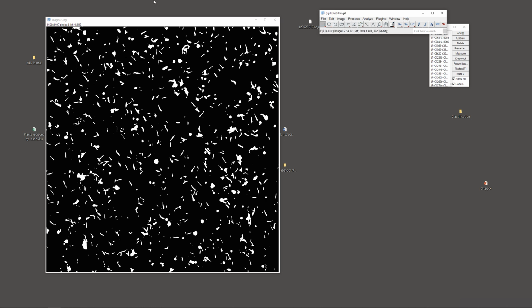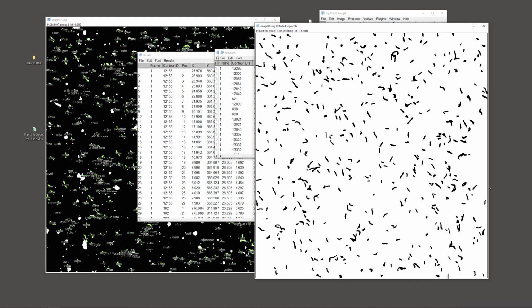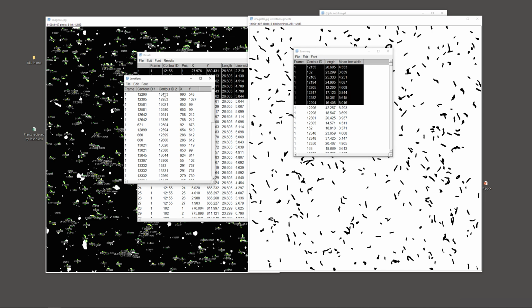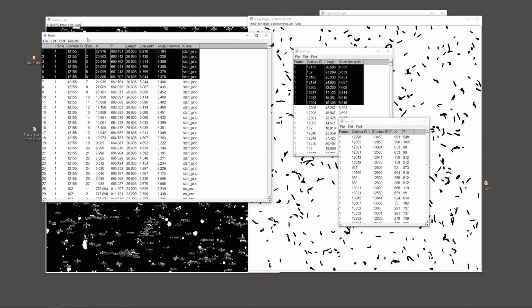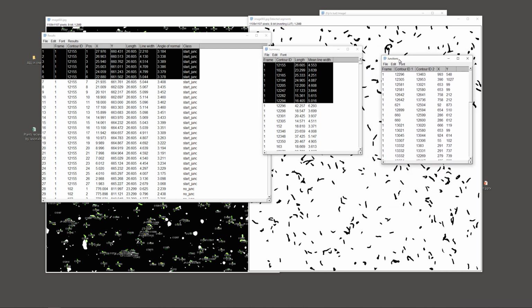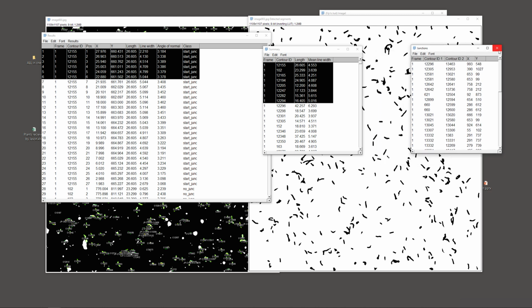So you will have this. You will have the image in which whatever is selected, all the objects, the length and width is quantified. You will have three tabs if you open the Results window, the Summary window and the Junctions. First, to explain, junction means that if the filopodia has a junction with any other filopodia. If you want to delete that as well, that's also fine, because this just gives you information on how many particles are touching each other. So just close it.